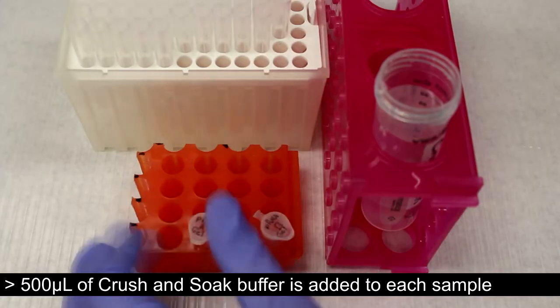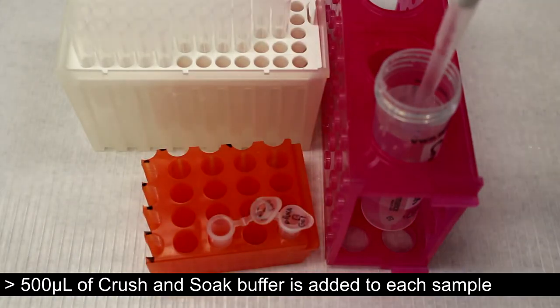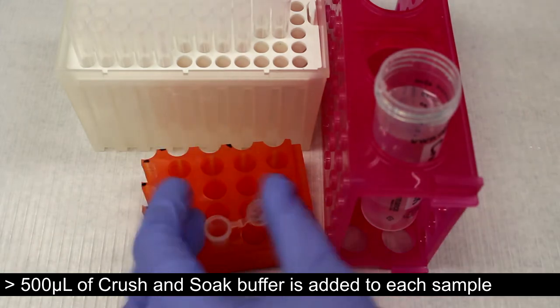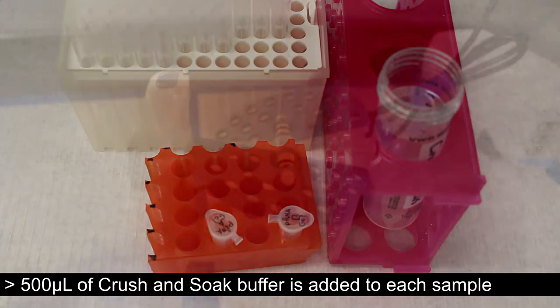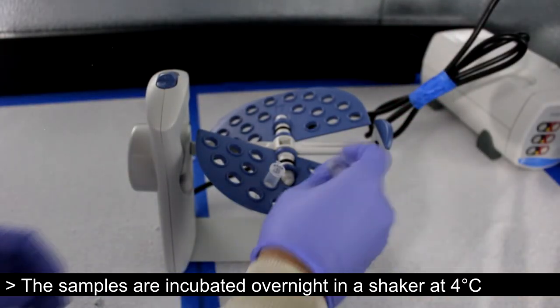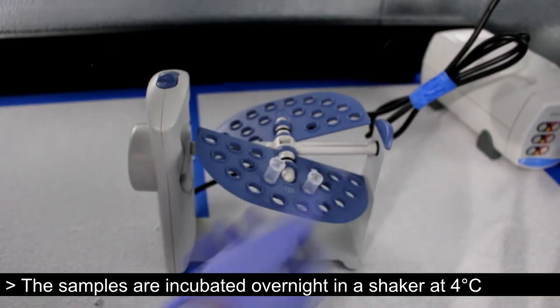500 microliters of crush-and-soak buffer are added to each sample. The samples are then incubated overnight in a shaker at 4 degrees Celsius.